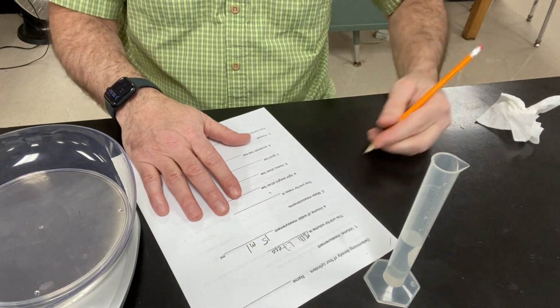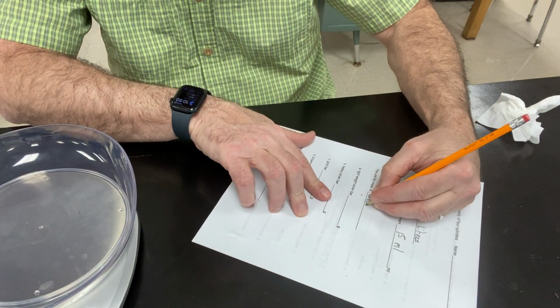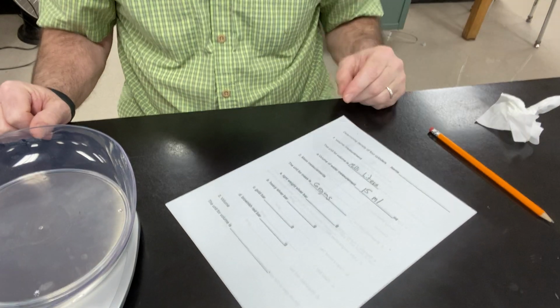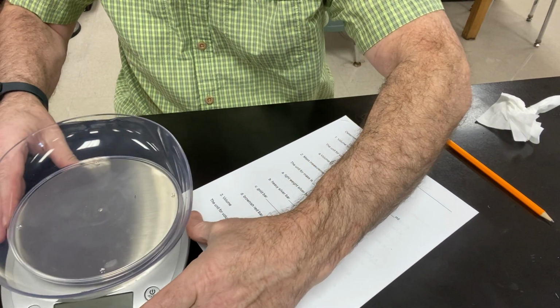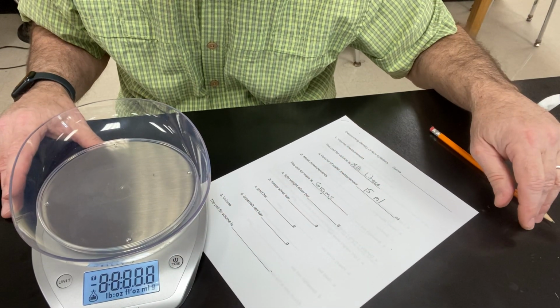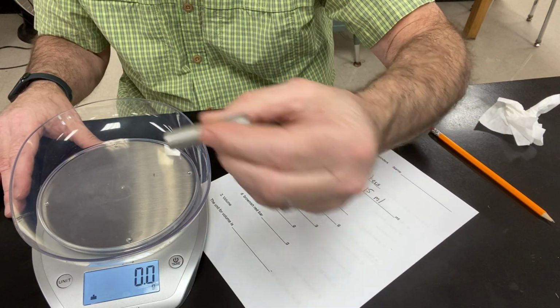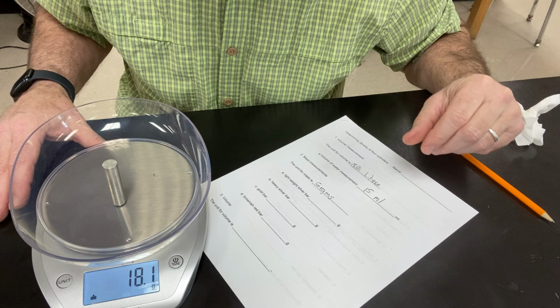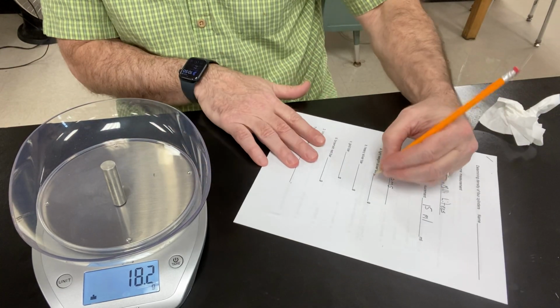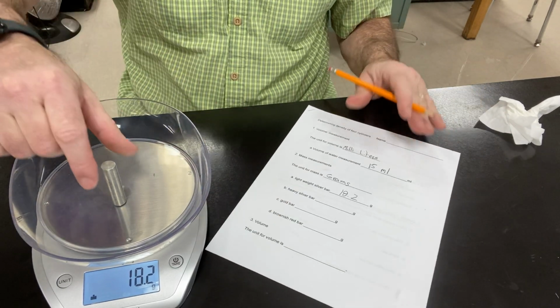Okay. Mass measurements, the unit for mass is grams, G-R-A-M-S. So go ahead and write that in there. And now I have to find the mass of these different bars. First one is the light silver bar. I'll turn it on, make sure it's in grams, and make sure it's at 0, and it is. So I take my light silver bar, I put it in there, and as you can probably see, it says 18.2. So I take my pencil and write 18.2. Okay, that's the mass of that.